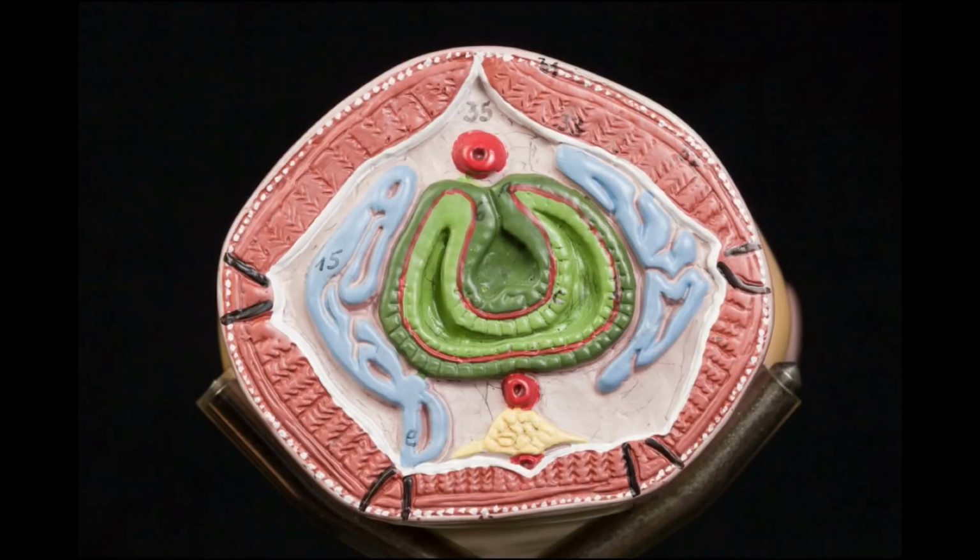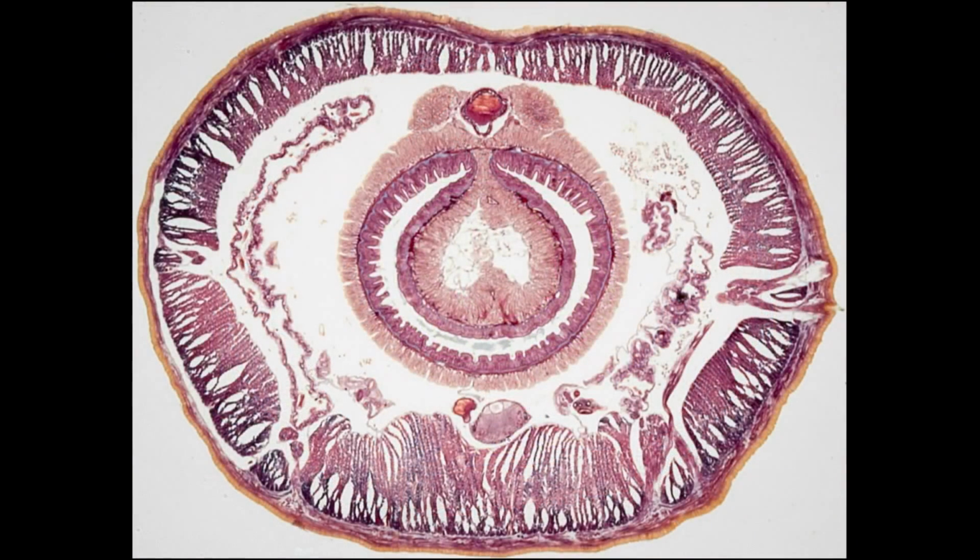Carefully note the location of the structures in this cross-sectional view of the model. Now, compare it to this microscope slide of a cross-section of a real earthworm. This slide is available to you in the laboratory. All the same parts are here, and in the same relative positions. The outer layer consists of the cuticle and epidermis. Just beneath that is the circular muscle layer. Here is the longitudinal muscle layer.